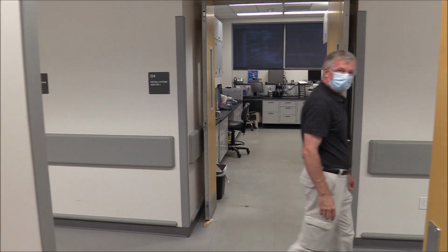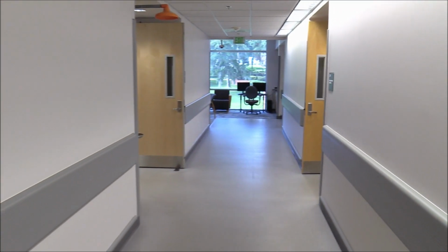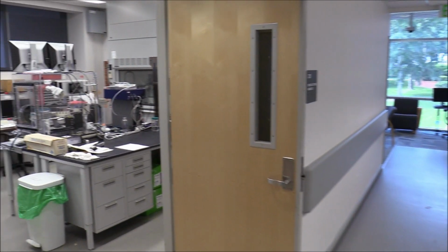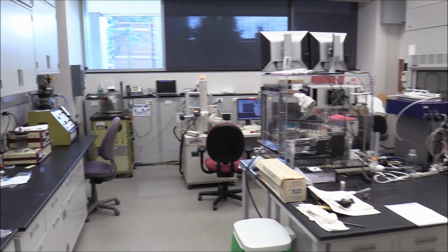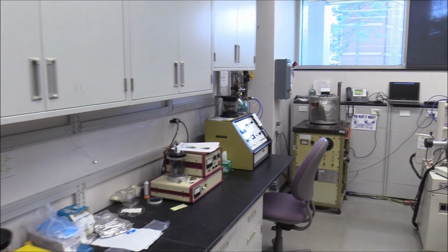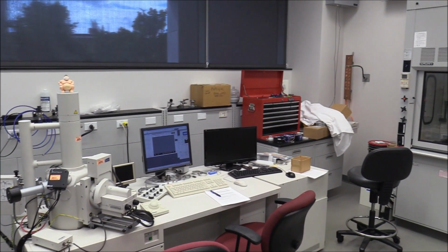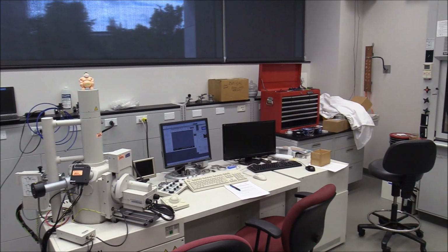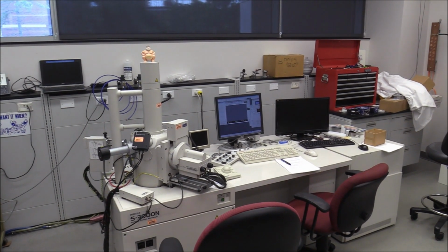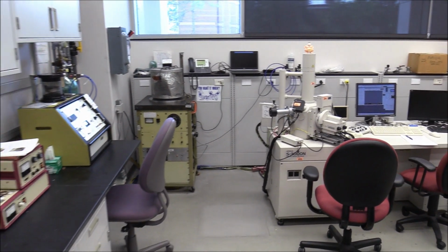Hi, Gary. Going across the hall in the sample preparation and microscopic lab, we have several options for conductive coatings on samples used mainly for scanning electron microscopy. Carbon evaporation and gold palladium sputter coatings are the most requested coatings. The Hitachi S3000 is a compact scanning electron microscope with a standard tungsten filament. It can image up to 100,000 times, and it has an EDS detector for elemental analysis.